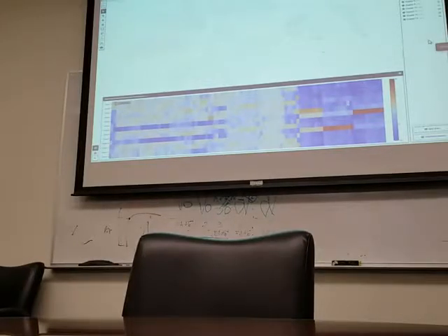Not specifically. I think you'd have to export it probably, and do it that way. How do you export it? You can export just the heat map image using that little camera icon. Oh, camera. Okay. But what about the data?